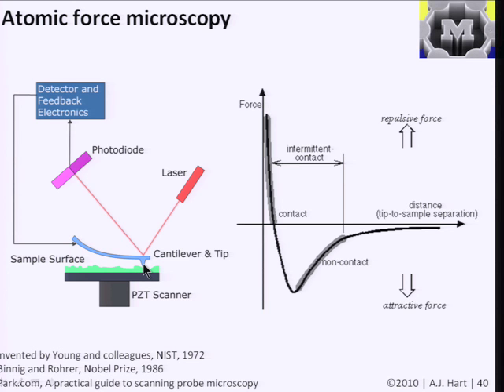And the ability to do that is built into these instruments and is well known. But here you measure the position of the cantilever with respect to the substrate by, say, reflecting a laser off the top of the cantilever and collecting the reflected signal on a photodiode. So you can imagine that if this is like a little compliant diving board, if this bounces up and down as you move your sample side to side or up and down, the position of this reflected spot on this detector will change, and you'll therefore be able to get an idea of how much the tip is moving. And it's also typical, for example, to calibrate the stiffness of these cantilevers. And if you know the stiffness of the cantilever and you know the displacement, then you can know the force. So you can also use AFM for a lot of nanomechanical characterization.